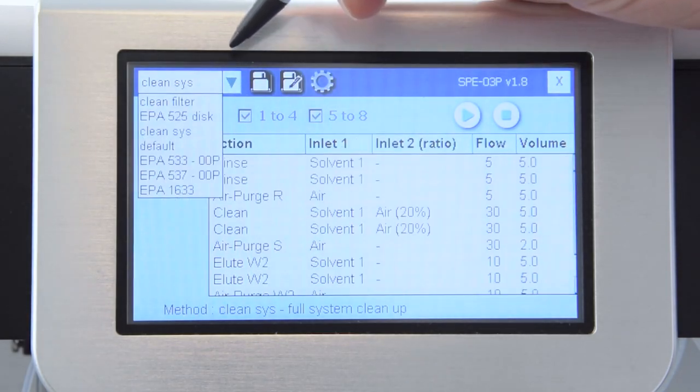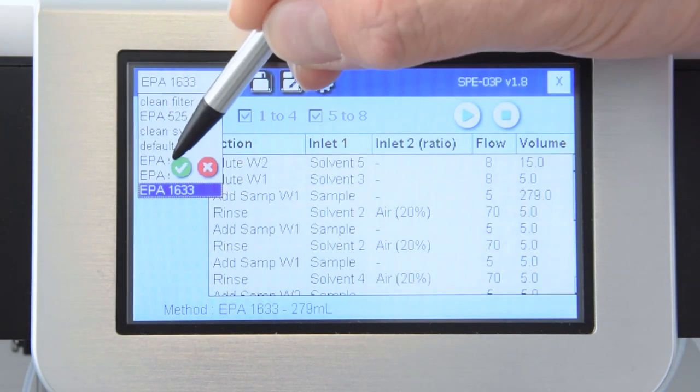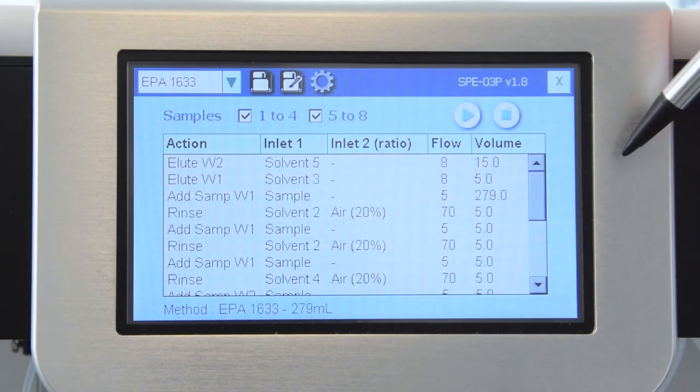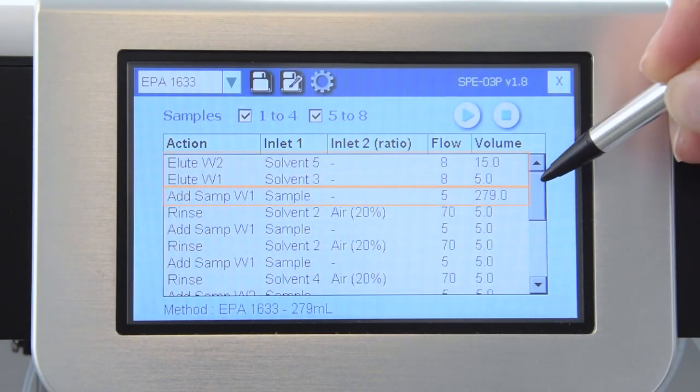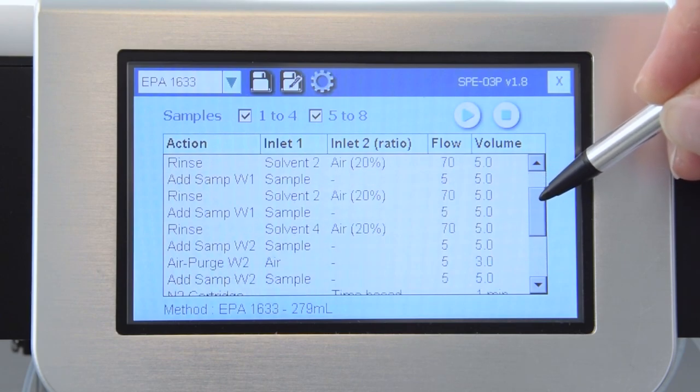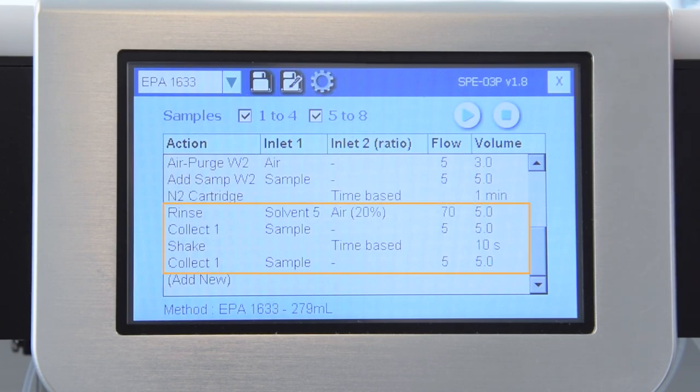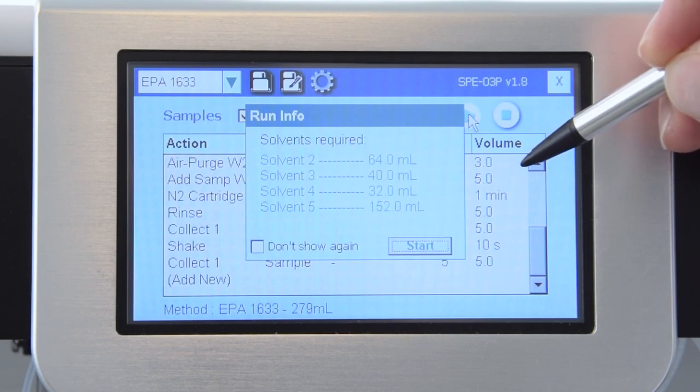Okay, let's see how these samples run. Now that the SPE03 is fully set up, let me bring up the built-in EPA method 1633. In accordance with the EPA procedure, the method consists of five main steps: pre-conditioning, sample loading, bottle and cartridge rinsing, nitrogen drying of the cartridges, and a final bottle rinse and dilution. To begin, simply tap start.